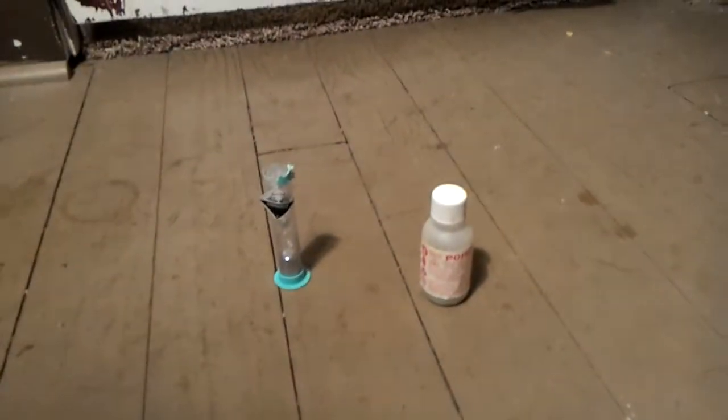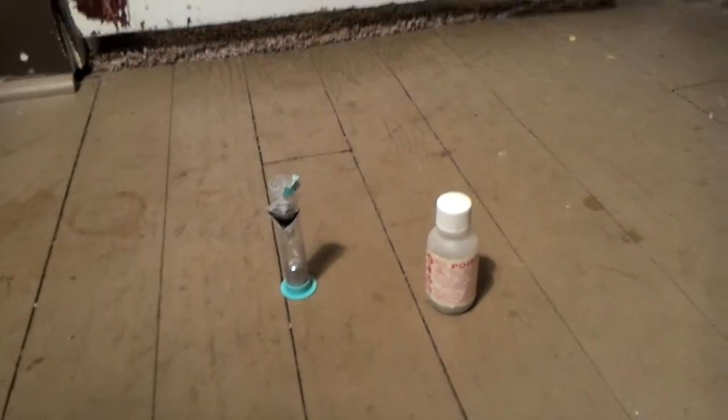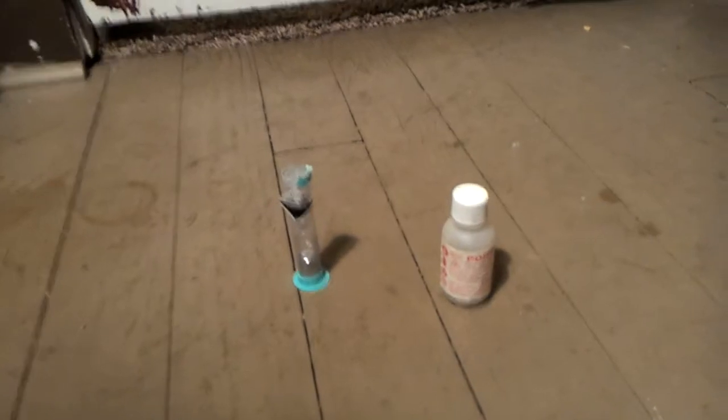What is up guys, TheRealDamonJackson here, and today I wanted to talk about mercury and the ways you should store it.